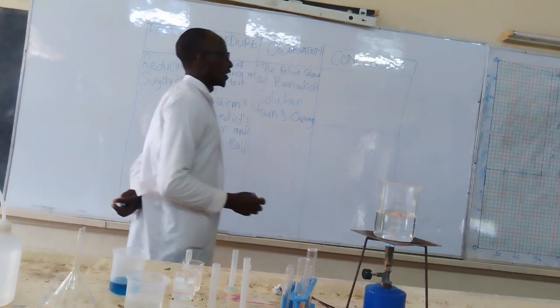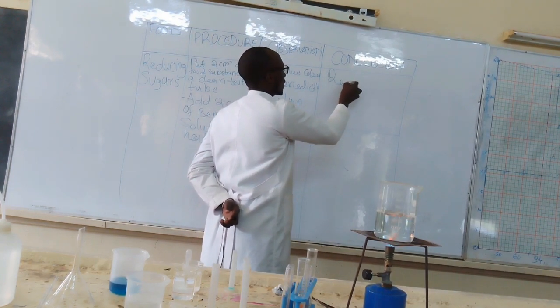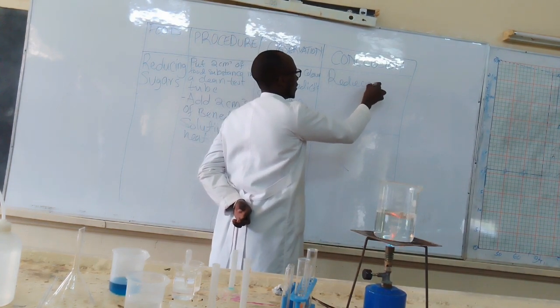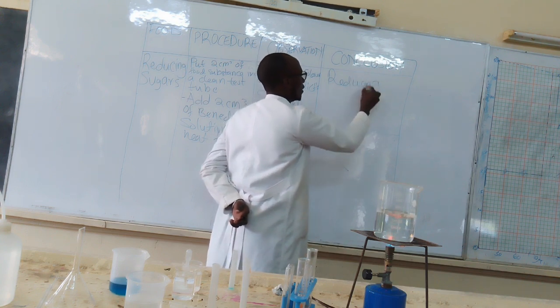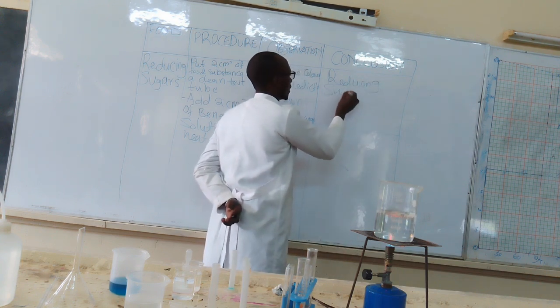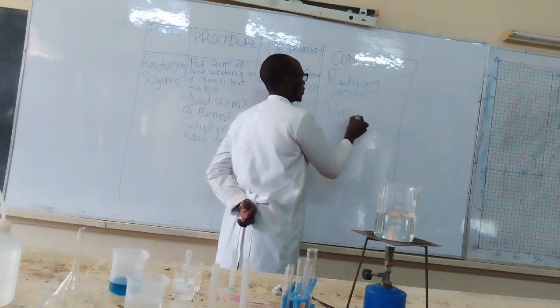So the conclusion that I will make here is that reducing sugars are present.